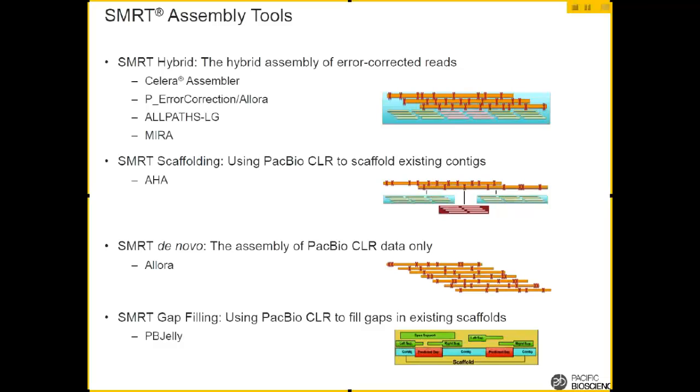The shorter Illumina reads are not going to help you bridge repeat regions. Also, like I said, Illumina has some regions that it just doesn't sequence as well. And even though your reads are less accurate, indicated in these diagrams by these X marks, which are incorrectly read bases, if you have some existing scaffold, you can imagine, and this is what they call their hybrid technology, basically saying you should use our technology to get really long reads, then use something cheap like Illumina to produce a lot of short reads.